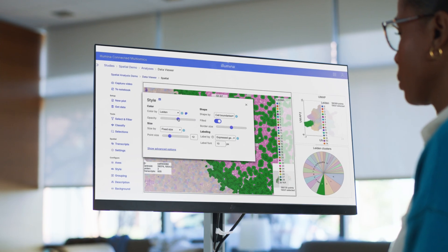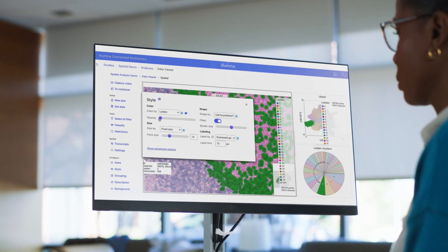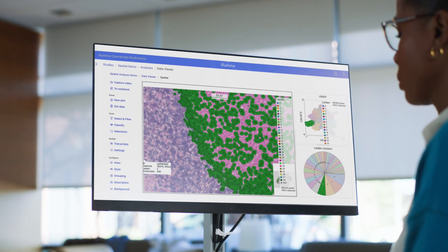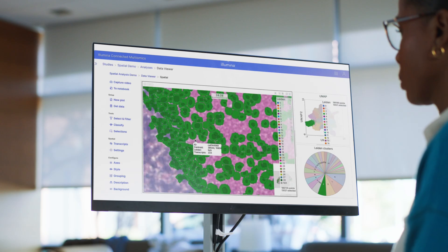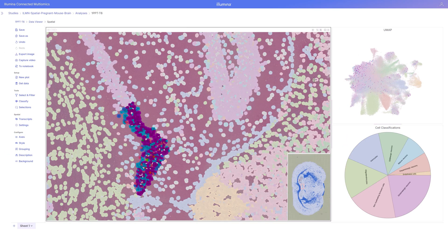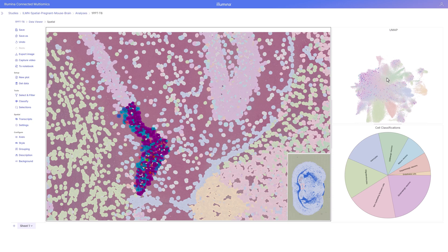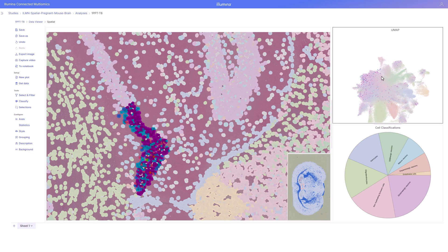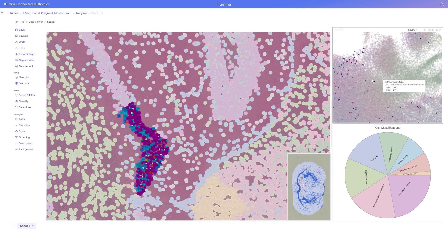Since Illumina Connected Multiomics is hosted on AWS, it scales with me. I can easily work with projects of any scale. Single cell and spatial studies are no problem.